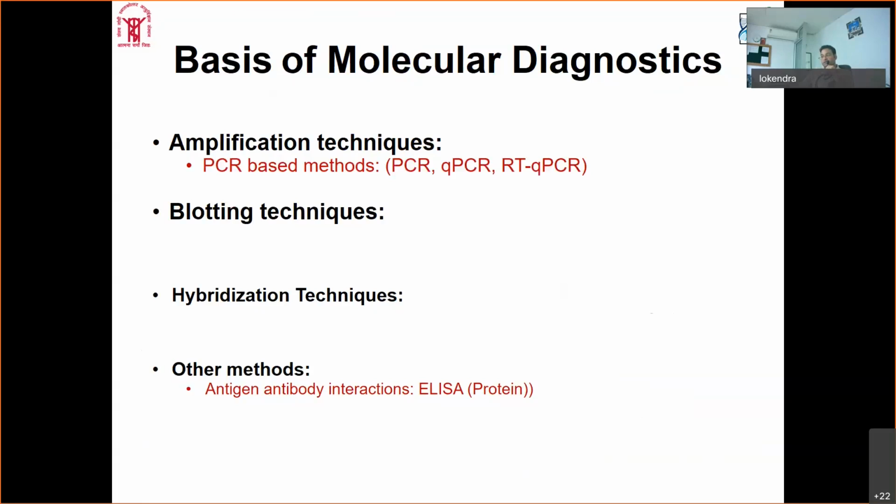Generally when we say PCR, we always have this thermal cycler in which we have primers, template DNA, and dNTPs, and that amplifies it. Eventually you load it onto an agarose gel and see the images along with the markers that you load in the lanes. Then you can qualitatively analyze whether your PCR product is there or not, or what kind of changes there are in the PCR product intensity. So this is generally normal routine PCR.